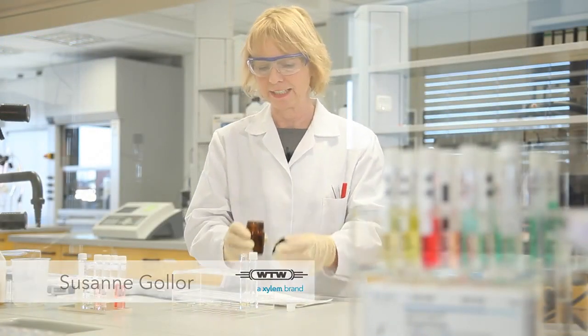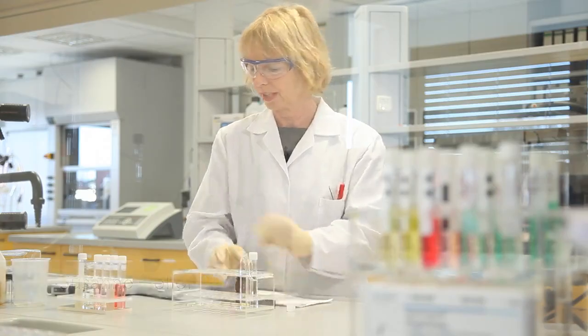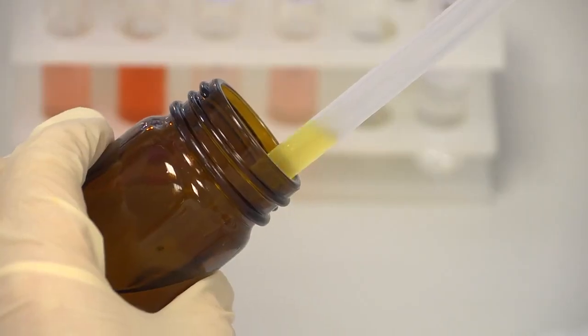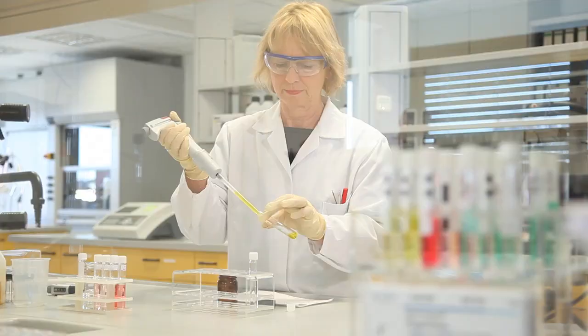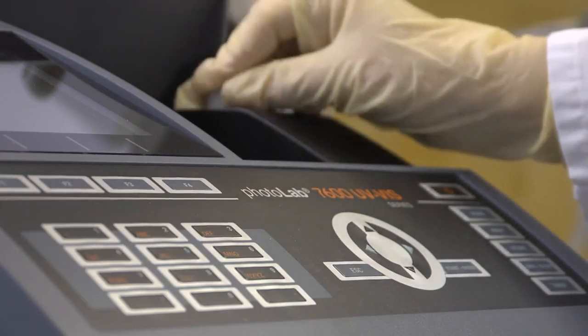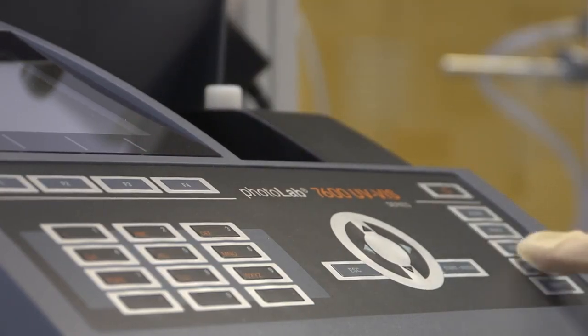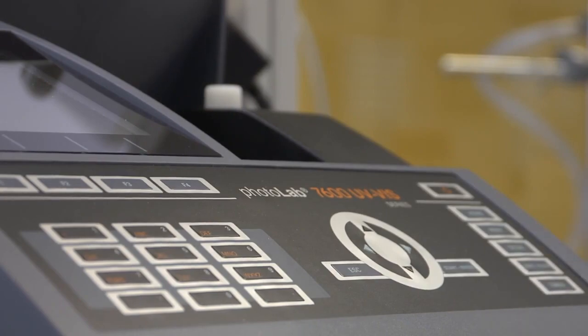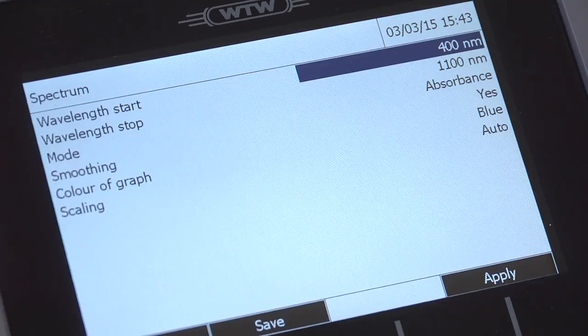Here we have a sample and want to determine its spectral characteristics. We pipette some of the sample into an empty round cell. First of all, we set the wavelength range that we want to analyze.